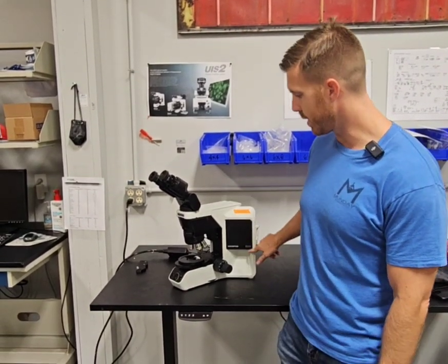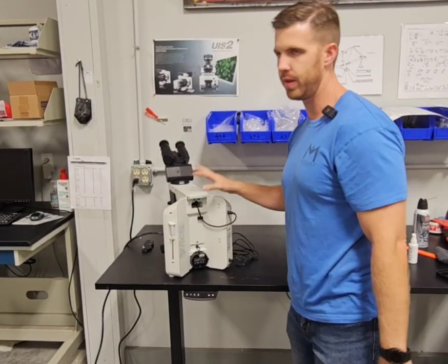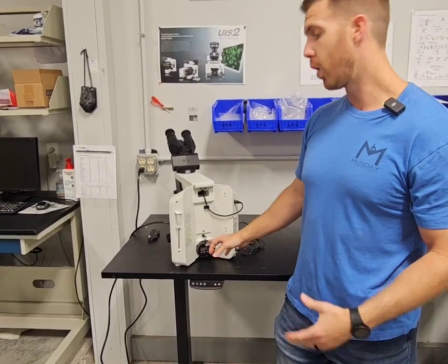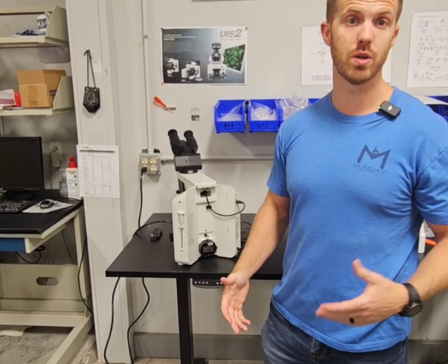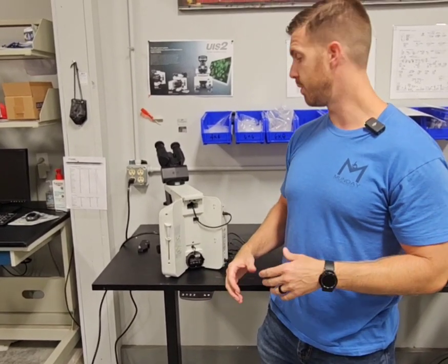So this is a BX46 right here. We're going to turn it around. Every now and then, if these get left on for an extended period of time, or they get older — maybe 10 years or older — they're getting to the end of their life and they'll start strobing or blinking, which is really difficult when you're trying to read a specimen.